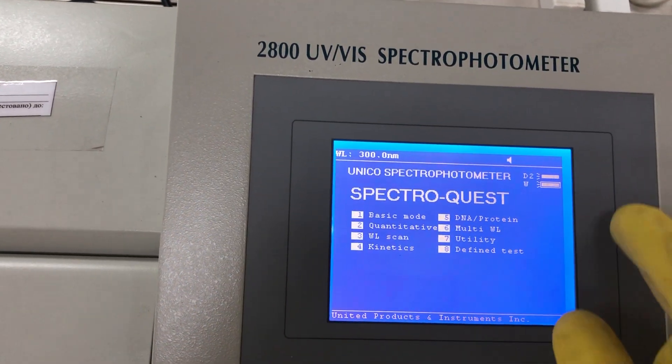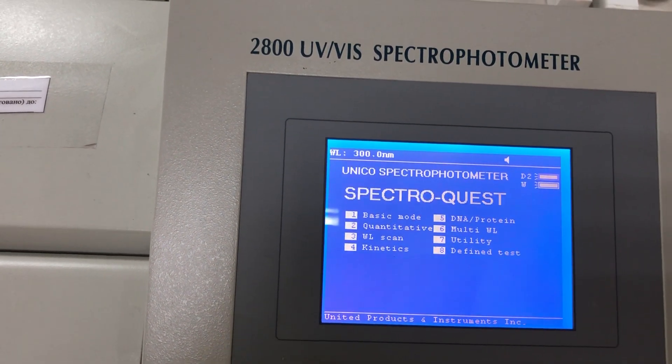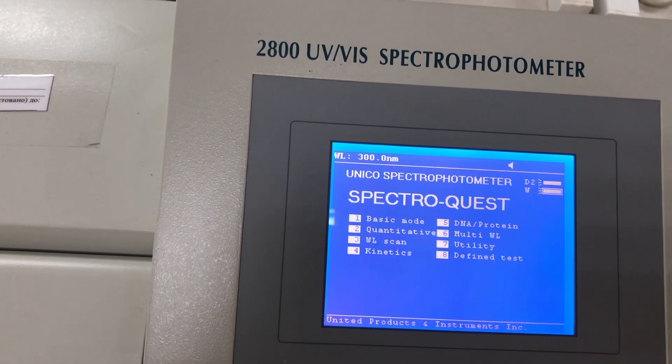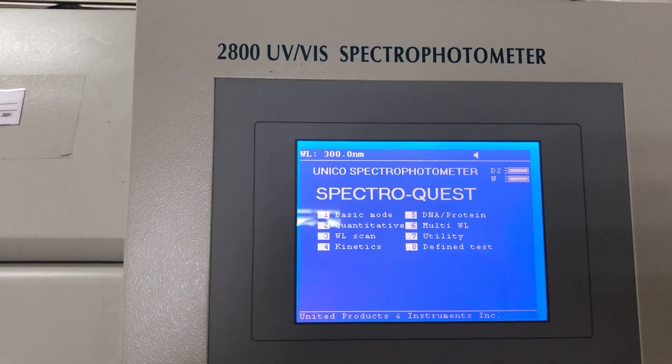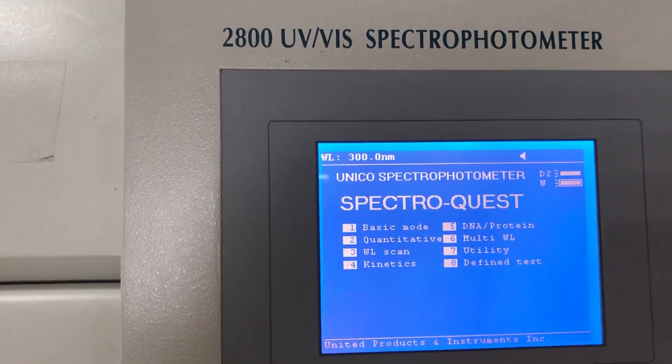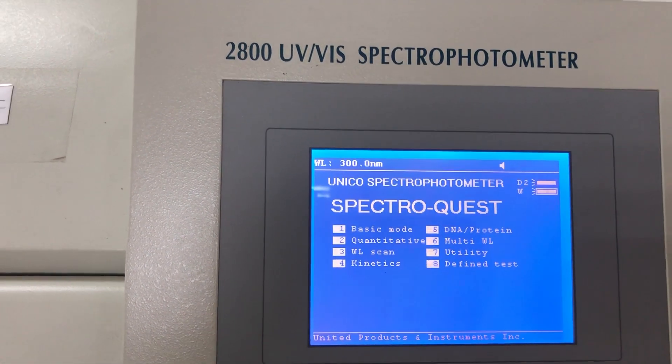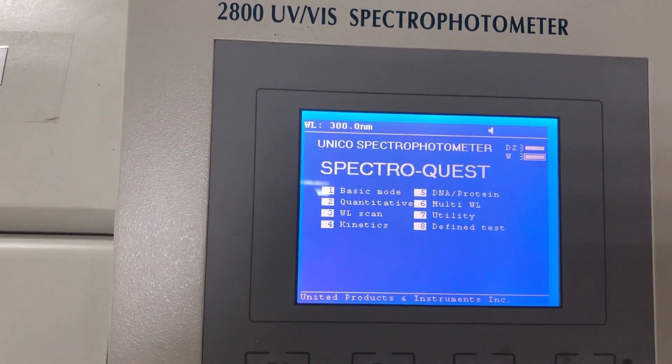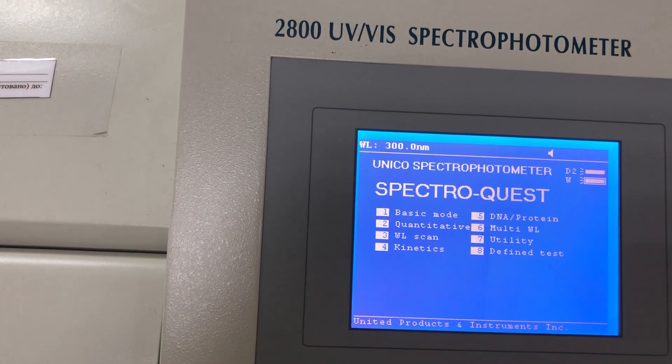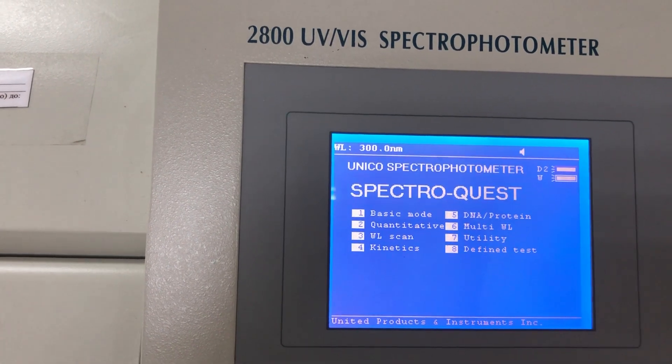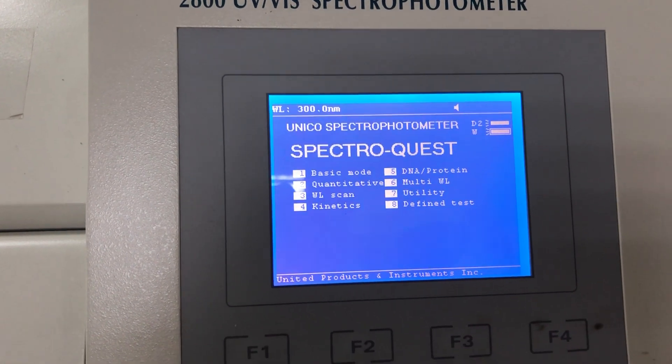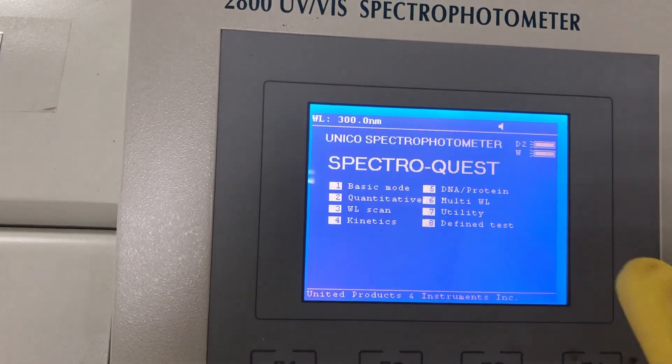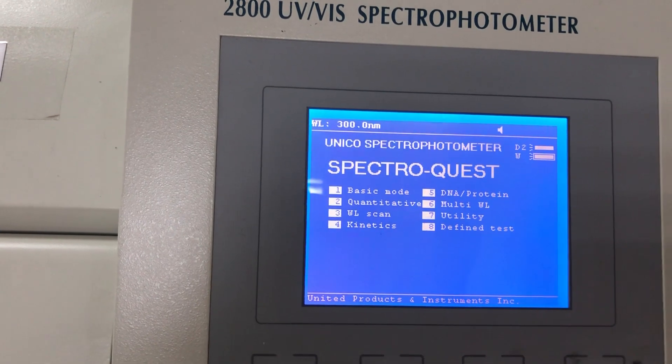This window is the main screen that you will see when the instrument gets initialized. We have here eight options to scan and set up the instrument. Here's basic mode, quantitative, and wavelength scan. These are the most important options. Another important one is number seven, utility. This is the settings of the device.